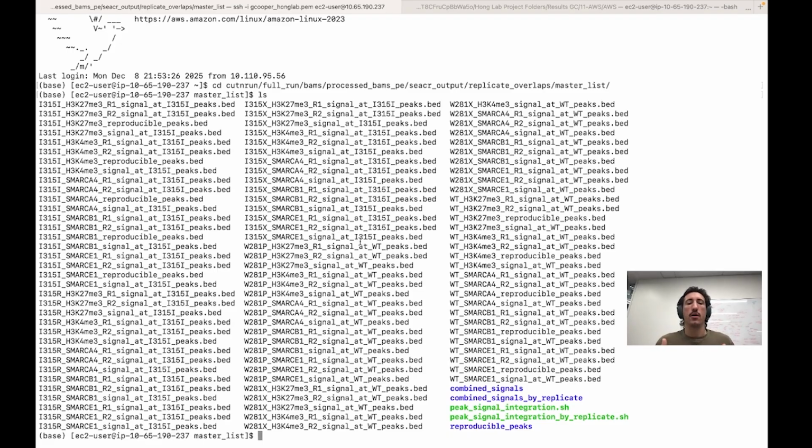binding site. And so if you're doing CUT&RUN analysis with a particular complex member like EZH2, SWI/SNF, RNA polymerase, or something like that, this is a pretty good idea, taking the union of multiple subunits to identify where this complex is actually binding. And we're being relatively permissive here by taking the union because a peak for one subunit might be called and not for the other two, but it's pretty unlikely that only one of these subunits is going to be binding alone since they're typically found within a complex. So the way that we're going to do this is just a simple bedtools merge command, and we're basically just going to call any peaks that are within 100 base pairs of each other as one singular consensus peak.